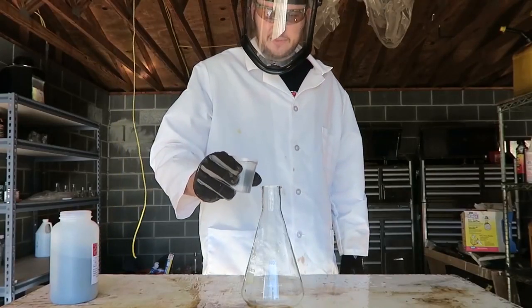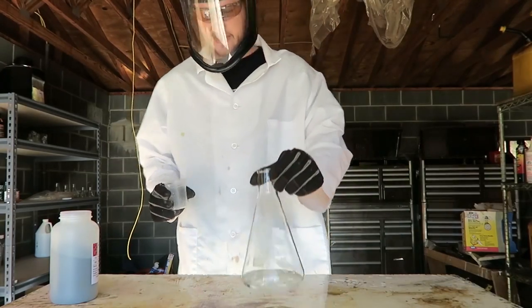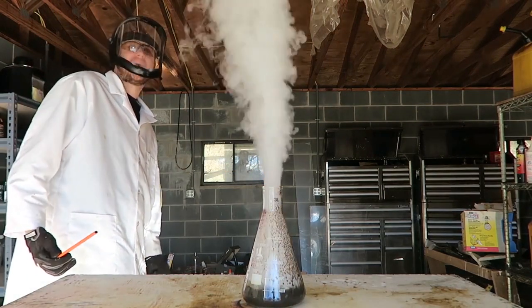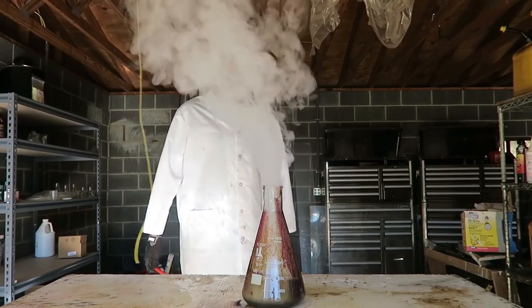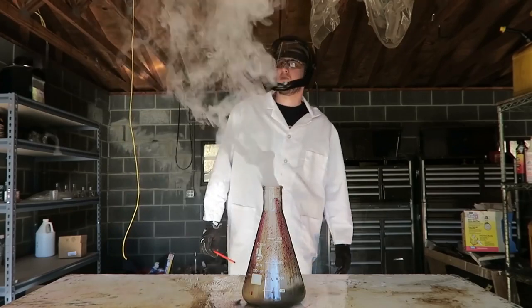I have hydrogen peroxide 30% or 35% in a container. Then I'm just going to add a little bit of potassium permanganate. Whoa — check out this smoke! This is so cool. Of course, stay in a ventilated room like I am. Pretty awesome — look at all this smoke!